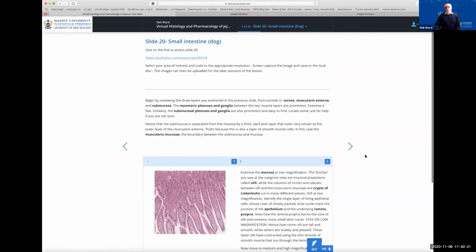We obviously need to describe what we're trying to do. We've obviously got to keep the tissue oxygenated at constant temperature, and it's in a physiological solution to ensure that the tissue is able to thrive. And in our lab, we had these instruction panels to help the students prepare their tissue and put it in a bath, so they would work through that.